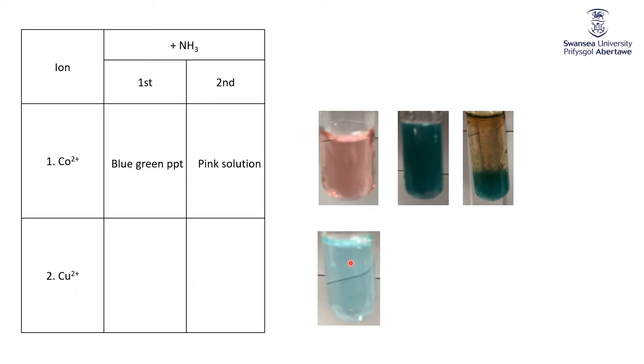Don't think you necessarily needed to know that for the cobalt, but you do need to know it for the copper 2 plus. Here's our copper 2 plus at the start. Nice light blue solution. We add in some first ammonia. The ammonia acts as a base, gives us that pale blue precipitate that's exactly the same that we saw when we took the copper ions and added hydroxide to it.